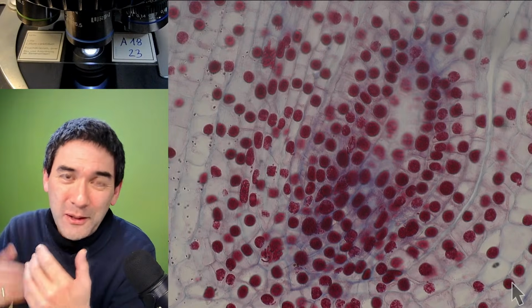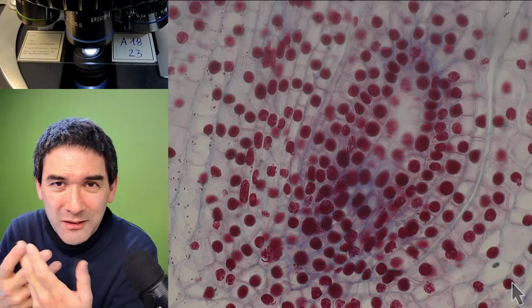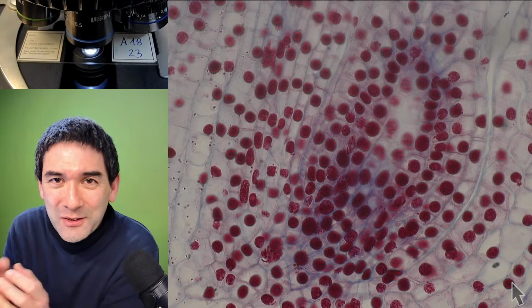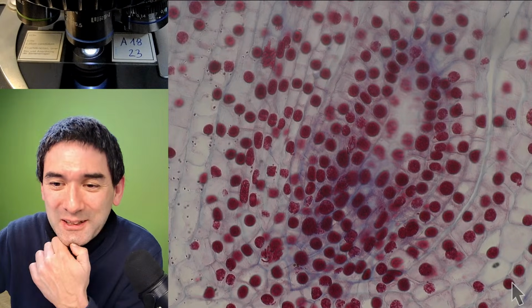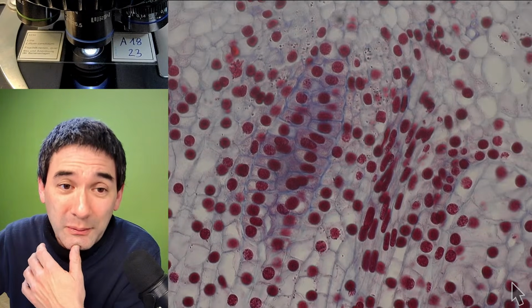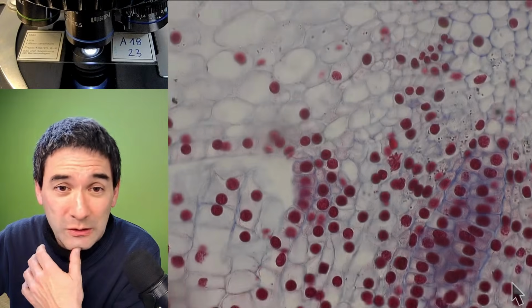Really interesting how people started to realize, now I'm getting a little philosophical, their own connection to their environment and to the microscopic environment. They saw similarities. I think it's quite nice. There's always something interesting in those. When you do a little bit of online research, wow, there's lots of stuff.